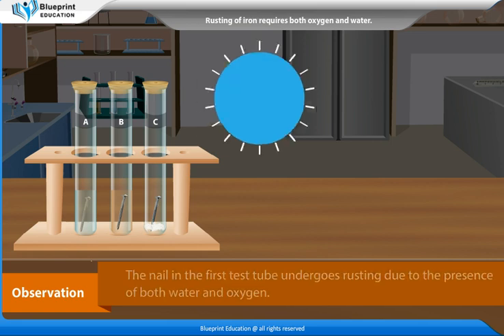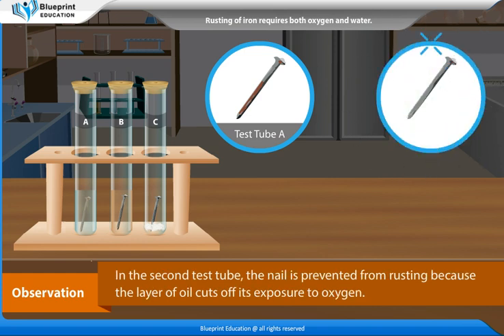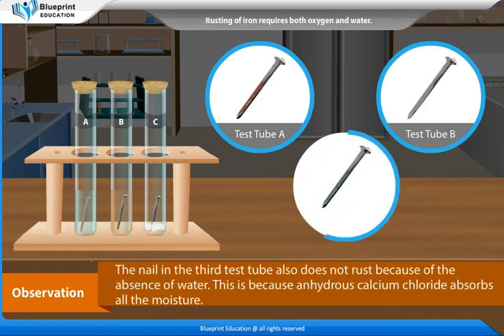Observations: The nail in the first test tube undergoes rusting due to the presence of both water and oxygen. In the second test tube, the nail is prevented from rusting because the layer of oil cuts off its exposure to oxygen. The nail in the third test tube also does not rust because of the absence of water, as anhydrous calcium chloride absorbs all the moisture.